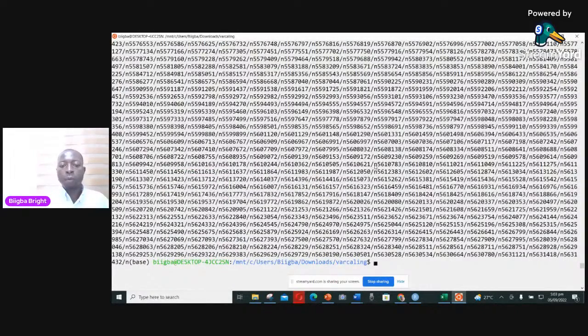And as I'm saying, I've already run them, and that is why I don't want to waste everybody's time. So that's about it for the three things we're supposed to do: read alignment, sequence mapping, variant calling, and then counting the variants and identifying different variants on a genome using a bacterial reference genome and that of the two isolates, which we found in Mycobacterium tuberculosis. That's about it for today.